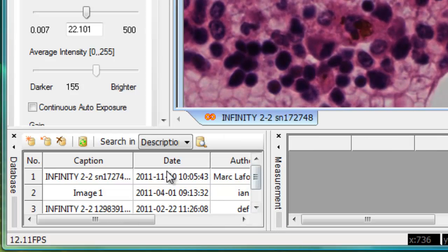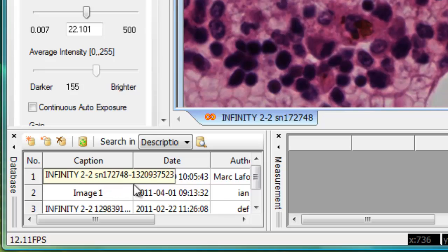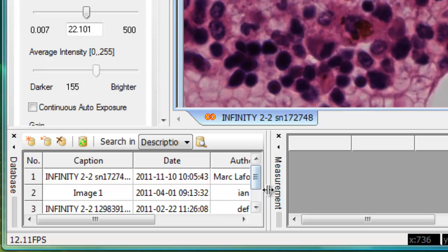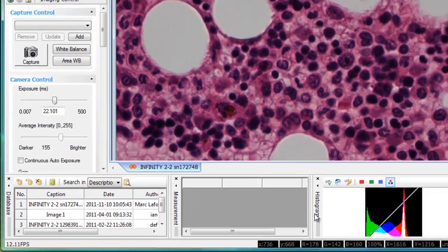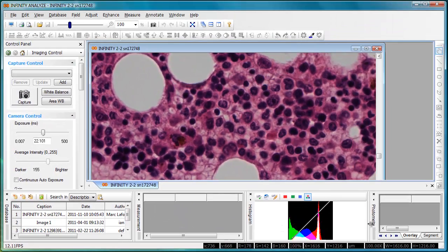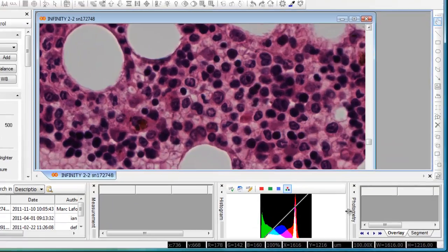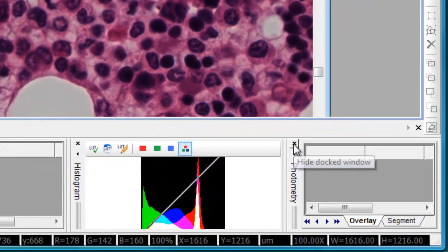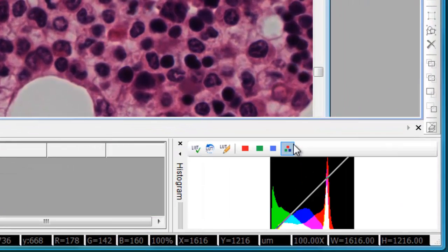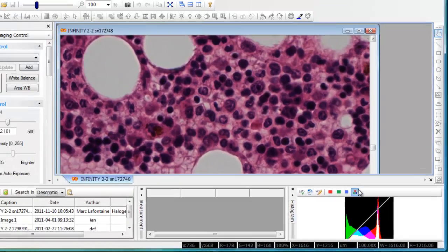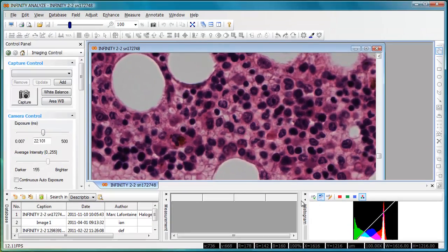Dragging the bars on either side allows you to extend or compress the database, measurement, histogram, and photometry auxiliary windows. For example, we'll get rid of the photometry auxiliary window as well.